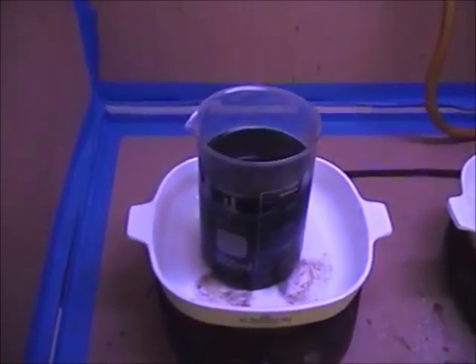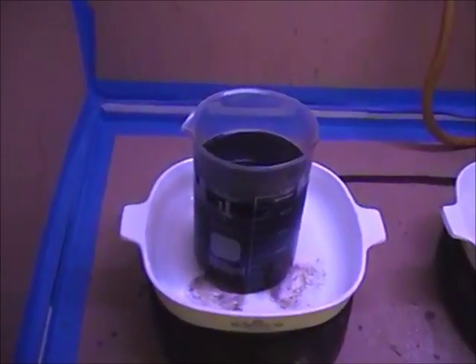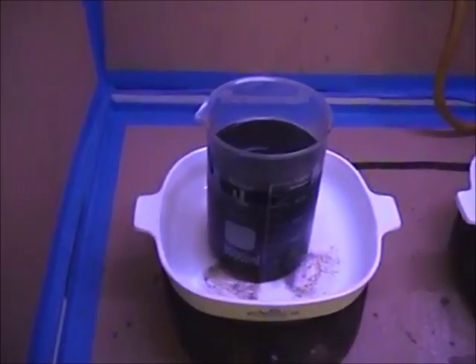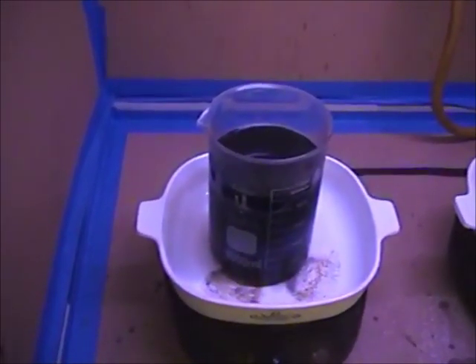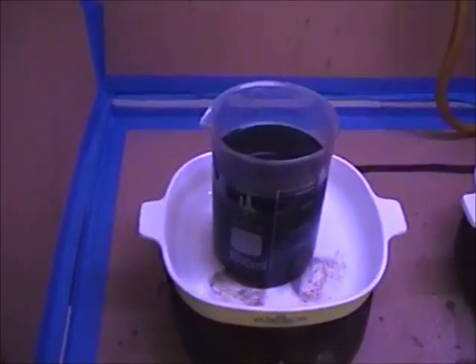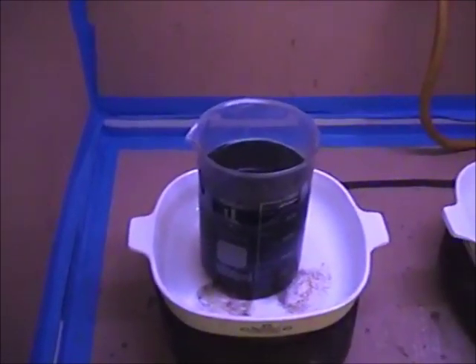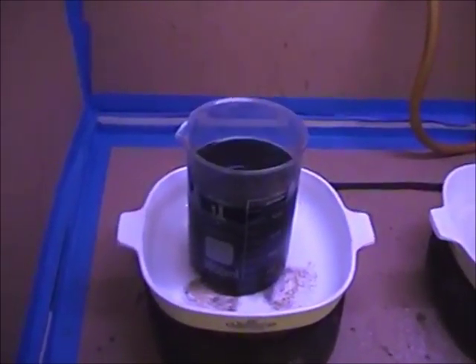We will add sodium formate to the beaker to reduce the silver nitrate to metallic silver. When we think that we're close to depleting the silver from the solution, we'll take a sample of that, put it in a test tube or on a watch glass, and add some chlorides to it. That could be salt dissolved in water, or hydrochloric acid. There's all types of different ways that you could add chlorides. If we see any chlorides reacting in the solution, then we know that we still have silver in our silver nitrate solution, and we need to add more sodium formate to reduce that.